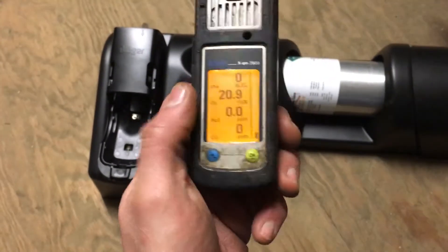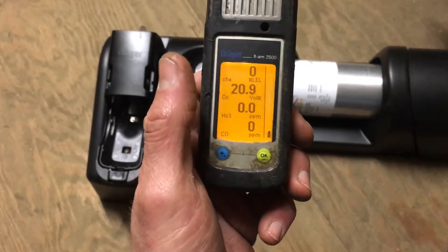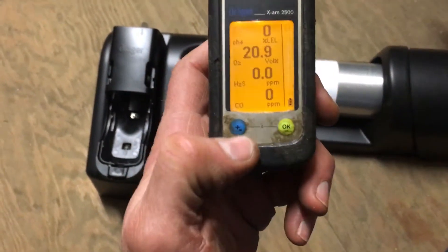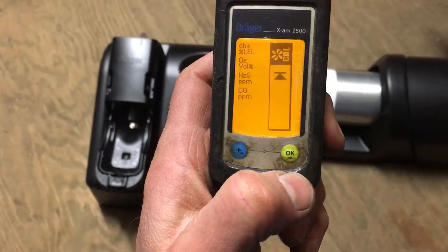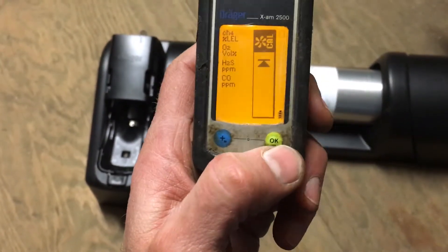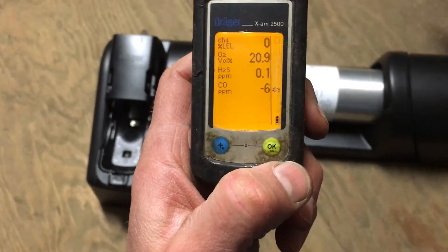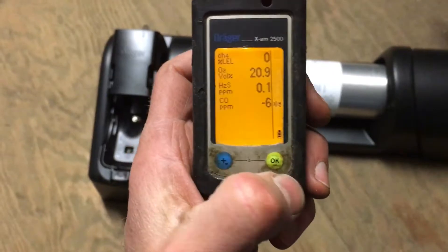One thing I do recommend after a bump test — Draeger likes you to do this — is to do a fresh air cal. Once you're done bump testing, push the blue button three times: one, two, three. You're going to get that fresh air cal symbol, which is the fan icon, then go ahead and push the green button once.